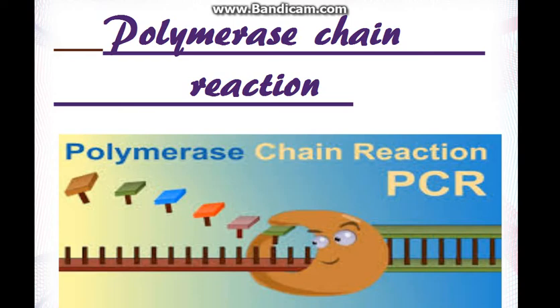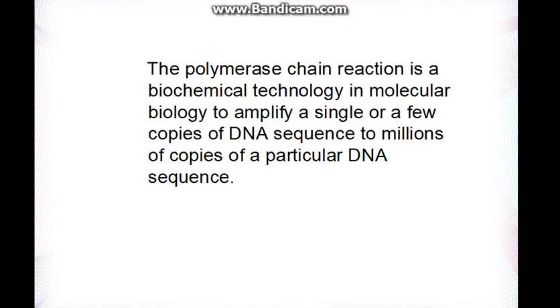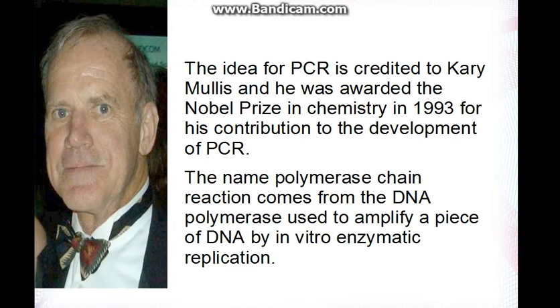Hello everyone, today we will discuss polymerase chain reaction, also known as PCR. Now what is it? It is a biochemical technology in molecular biology to amplify a single or a few copies of a DNA sequence to millions of copies of that particular DNA sequence. This idea was given by Mullis, for which he was awarded the Nobel Prize in 1993.